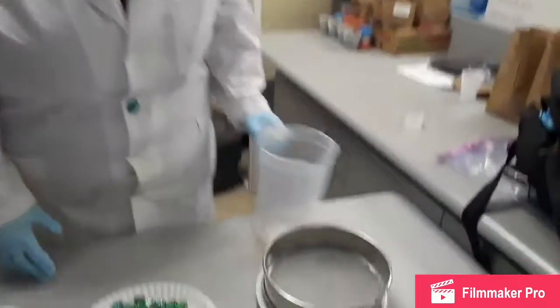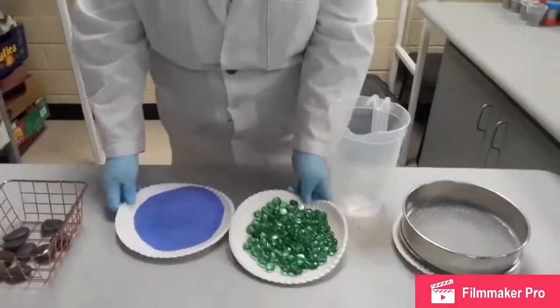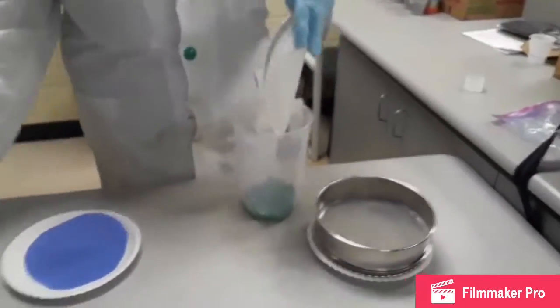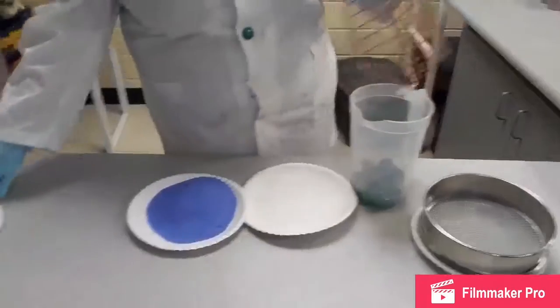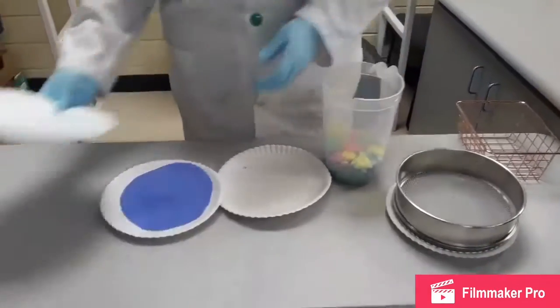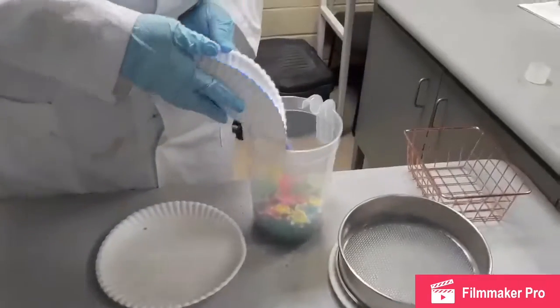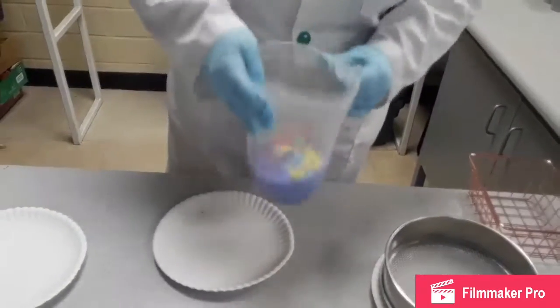Now we will begin the experiment. First we'll mix all of our different materials together to create a well-mixed mixture. It doesn't matter what order — we'll add the rocks, add the bigger rocks, add the frogs, and then finally the sand. Nice pretty blue sand. We'll mix this together.